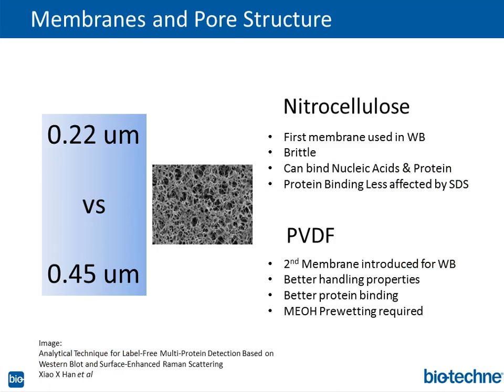Okay, I kind of alluded to this, and maybe I jumped the gun here, but you've got 2 basic membranes. And by the way, nitrocellulose obviously has its advantages. It's the thing that started it all, and if you're getting great blots with nitrocellulose, you know what? You stick with it. It's basically a combinatorial binding mechanism, which is hydrophobic interaction with those non-polar amino acids, tryptophans, phenylalanines, isoleucines, and then there's a lot of dipole-dipole electrostatic interaction. And thus it uses both of those to get binding to happen.